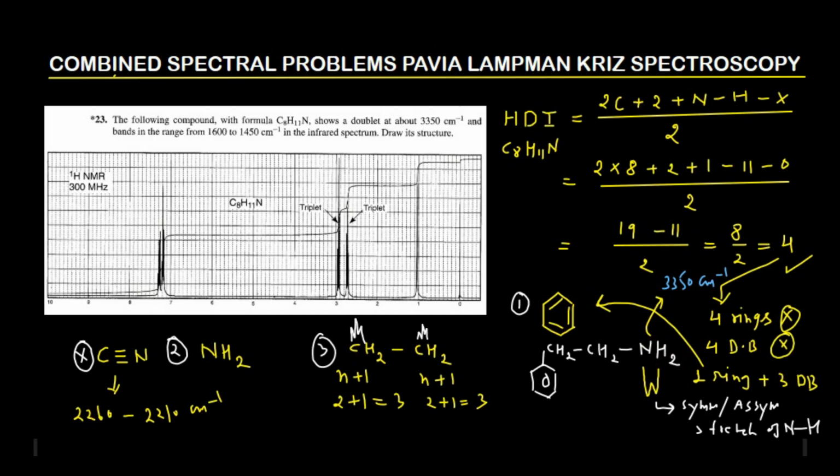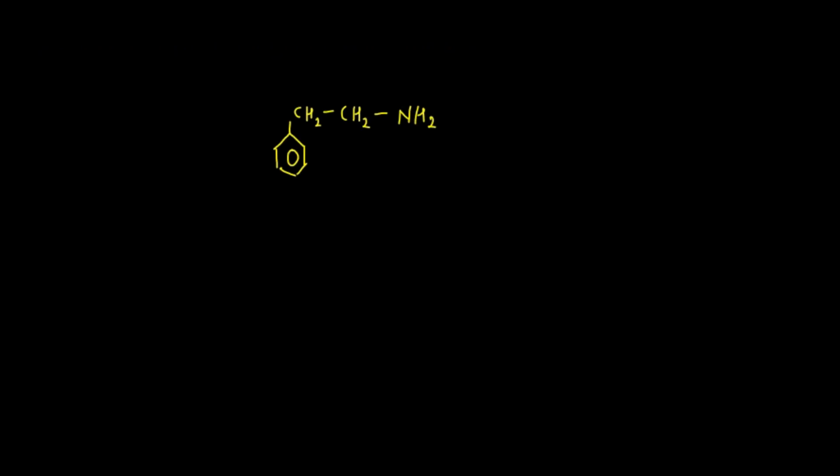The NH2 group in the proton NMR spectrum, basically the amine protons, generally gives a broad singlet. However, this singlet is not very broad, but this NH2 gives a broad singlet at 1.2 ppm. If you carefully look, this is resonating at 1.2 ppm. And this was giving a triplet. This is also giving a triplet. And this will give a singlet. Generally the chemical shift of the NH proton is roughly 1.2 ppm.